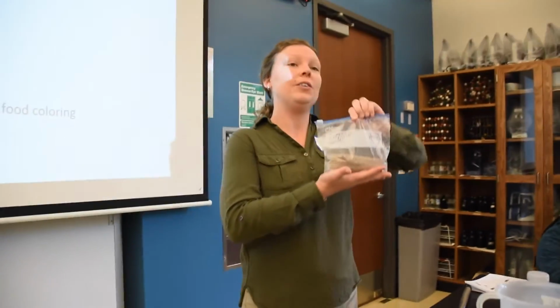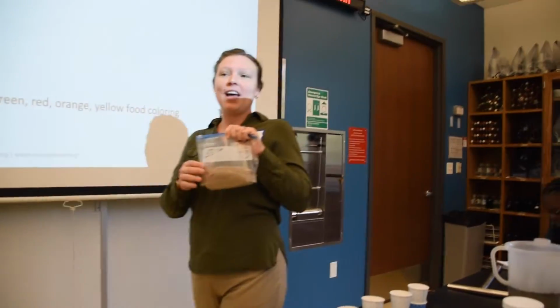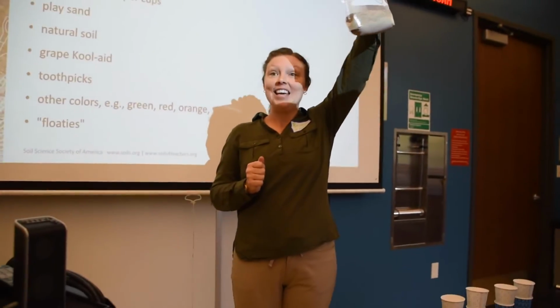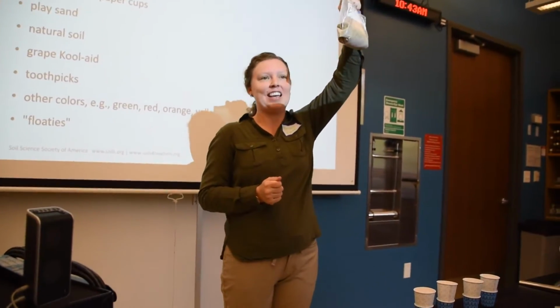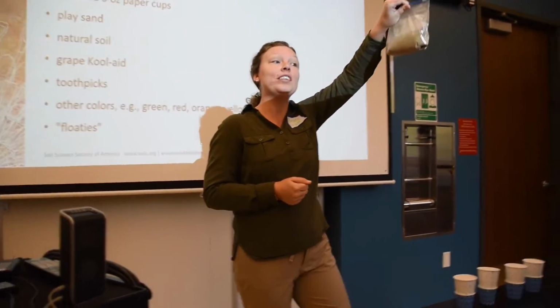So now we are going to use the soil that came with your buckets. So you should have a Ziploc bag with lots of different types of soil. There's one in there that's sand, and it's clearly sand, and you'll be able to tell exactly which one it is. I think it's the only one that's not labeled.